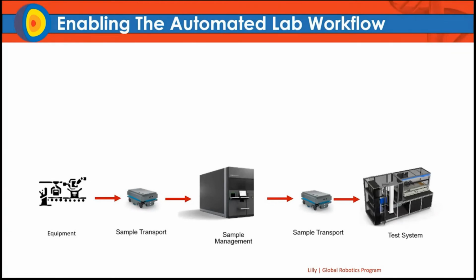We developed a high-level roadmap of where we see our laboratories in the near future. We want to develop sample transport systems that transport material from production to our sample management systems, and then from our sample management systems to our test systems.